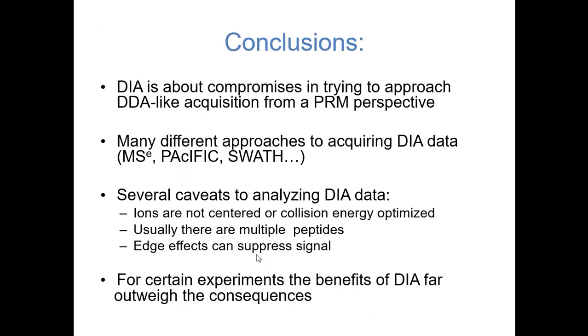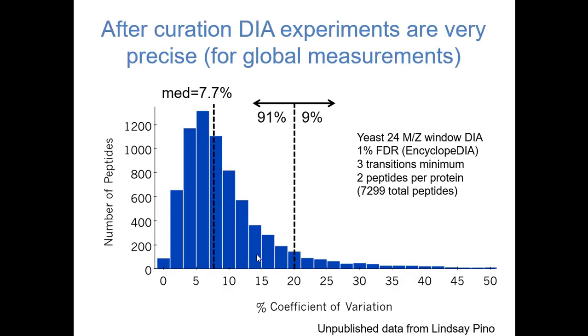Okay, so just to kind of... Previous slide, I'm assuming these are 3 injections. 3 injections of the same sample. Yeah. So we're not talking about 6 injections or 10 injections or 20 injections. This is just 3 injections, like a normal triplicate.